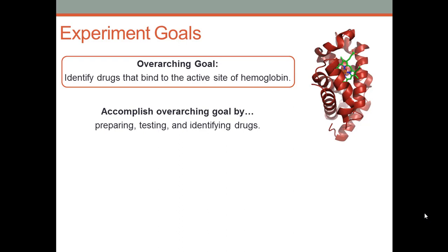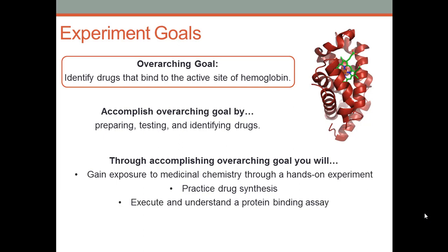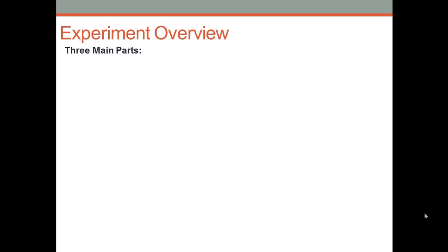drugs for hemoglobin. And so by accomplishing the entire experiment, I hope you will gain exposure to the field of medicinal chemistry. You'll definitely get to practice drug synthesis, and you'll get to execute and hopefully understand a protein binding assay. And finally, you'll get to analyze a larger set of data to identify those effective drugs.